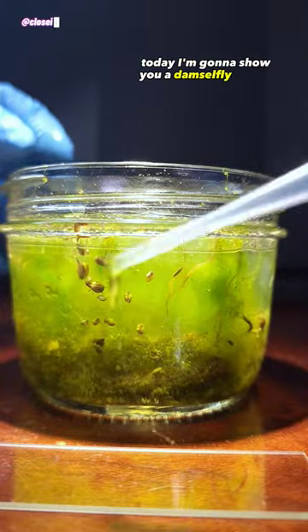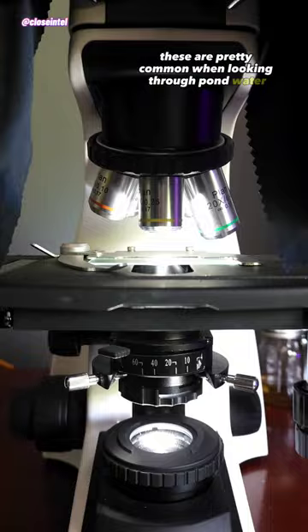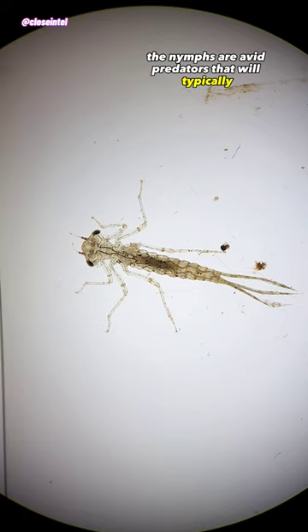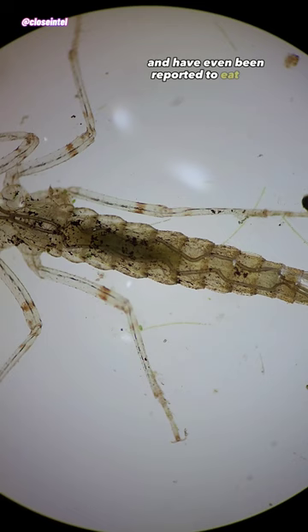Today I'm going to show you a damselfly nymph under a microscope. These are pretty common when looking through pond water and I usually always find one in my samples. The nymphs are avid predators that will typically eat anything they can get their hands on, and have even been reported to eat fish if they're small enough.